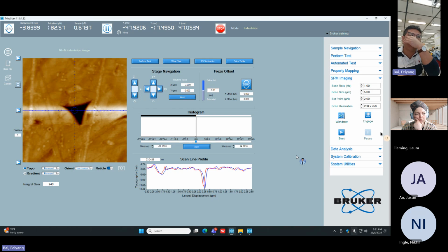So our Dr. Nico just asked a question. For example, if we have our substrate as our electrode and we indent, that will, let's say, get a 5 nanometer or 10 nanometer hole, okay? And then we're going to coat it. Let's say we indent it for 10 nanometer.